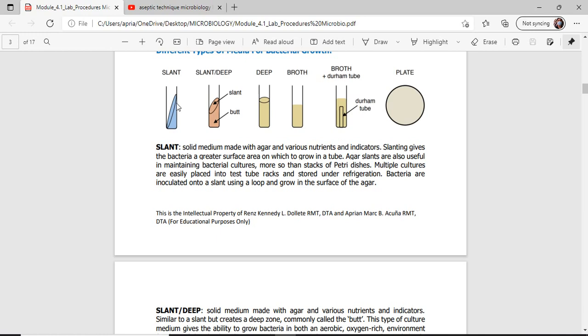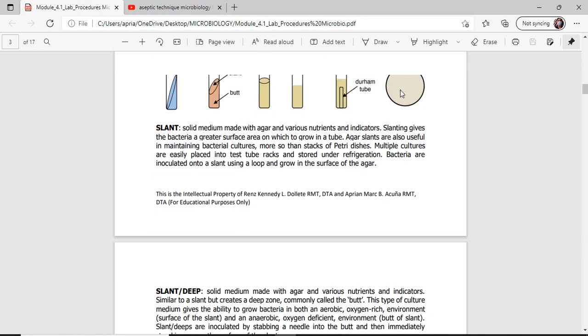Okay, or ang imong mga tube. Okay, because you will have a test tube rack. Yung mga test tube rack depende kung ano kadamo ang pwede niya ma-handle kaysa sa agar plate that is very space consuming, okay, sa space kag sa imong nga agar mismo, kag mas budlay i-handle kag mas secure ang mga tube nga man you will be having a cap, okay, securing sa unod ya than your agar plate which is separated nga duha ka glass covers.